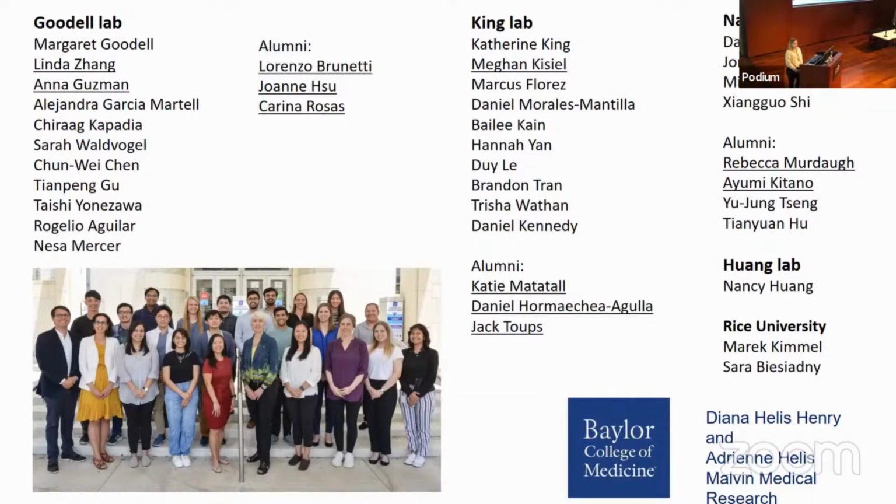Hi, really nice talk. I was wondering why you picked CFSE as a dye, and did you try also other proliferation dyes? No, we started with using CFSE and CTV because we can nicely distinguish it in flow. Then combining it with all our other markers, making it the best combination for staining for flow. Was it the best combination because you knew CFSE fitted in your panel? Yes. Okay. Thank you.